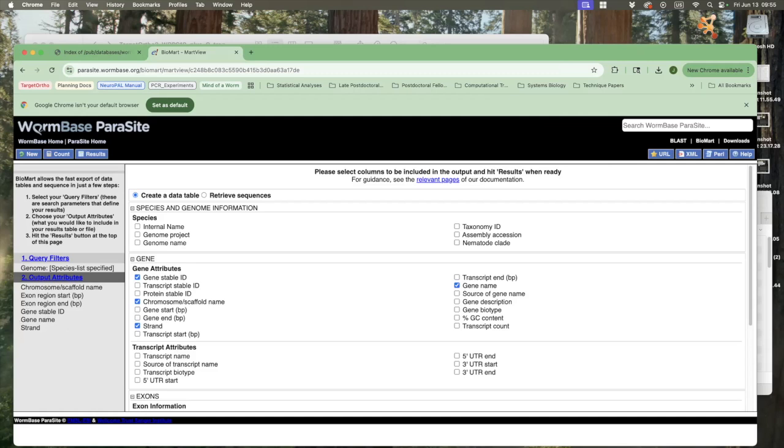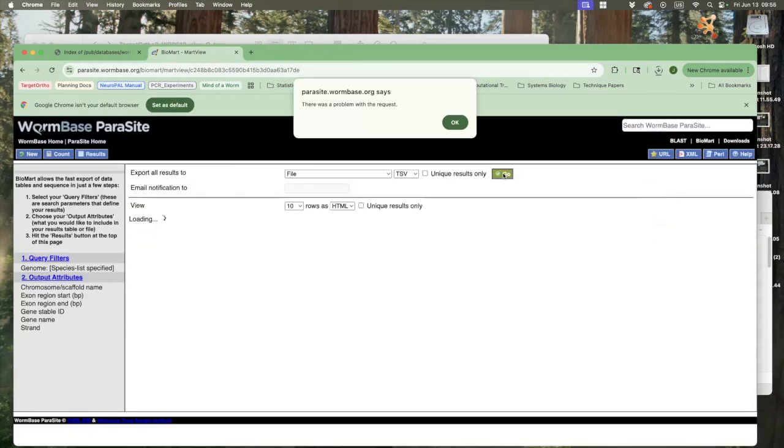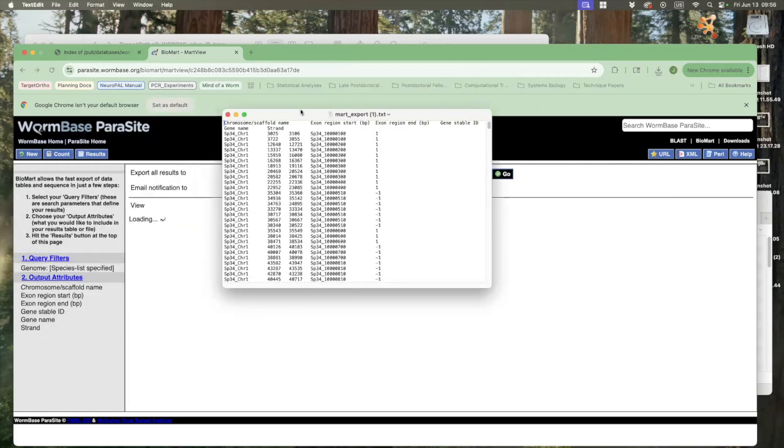Okay. Then click results and then click go. Okay. Look at this. Now this is what the file looks like.